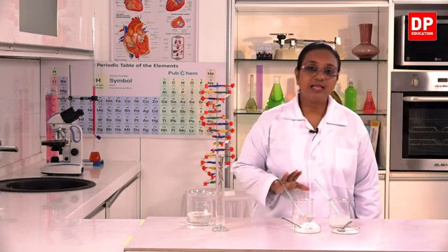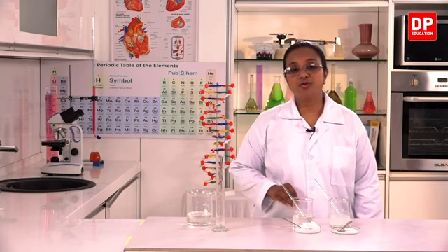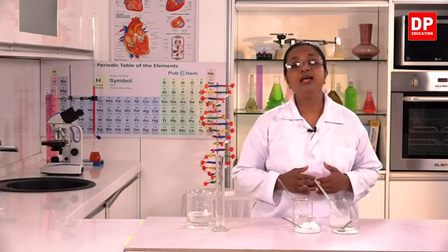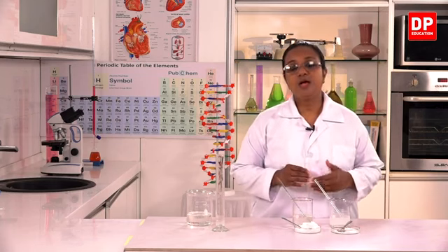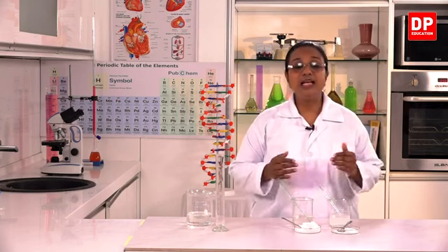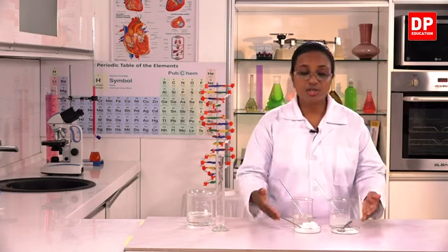So obviously more amount of sodium chloride dissolves in water compared to the calcium hydroxide. So from this we can confirm that the solubility depends on the nature of the solute.